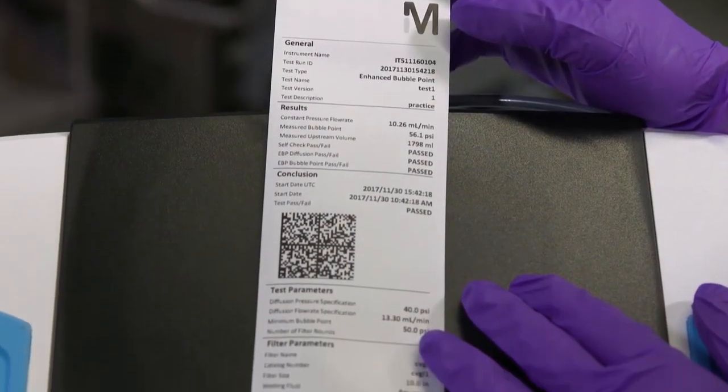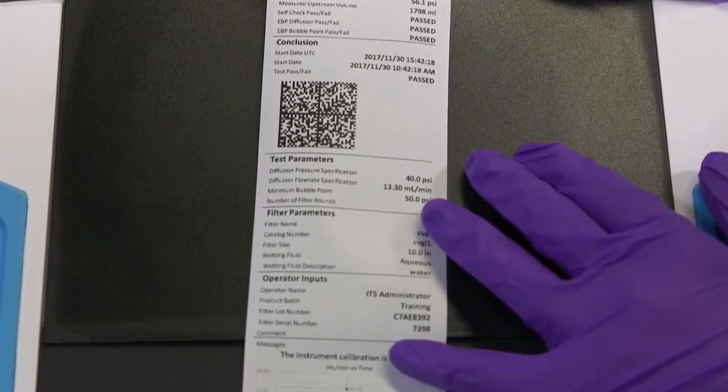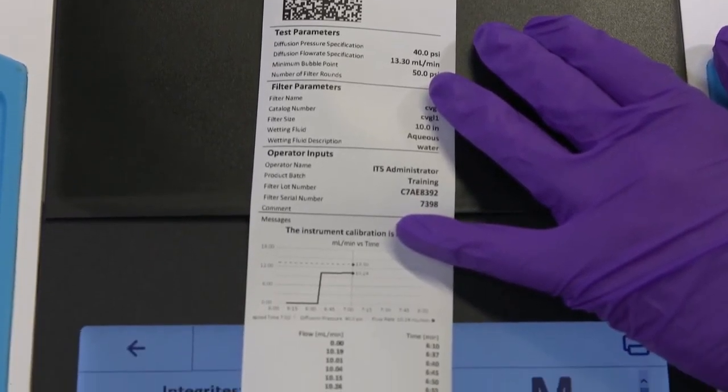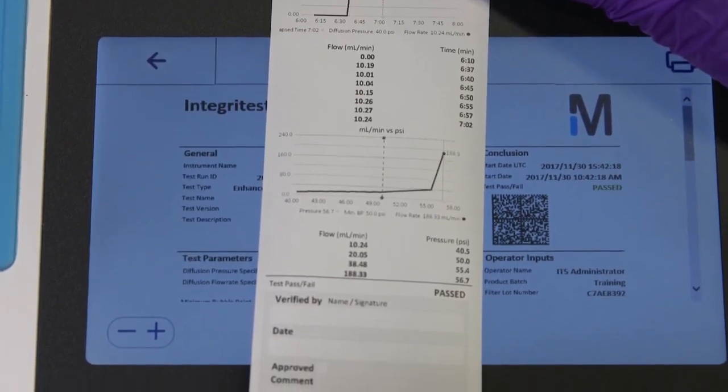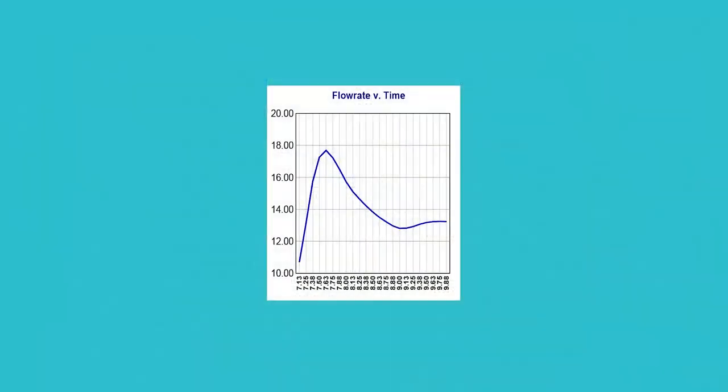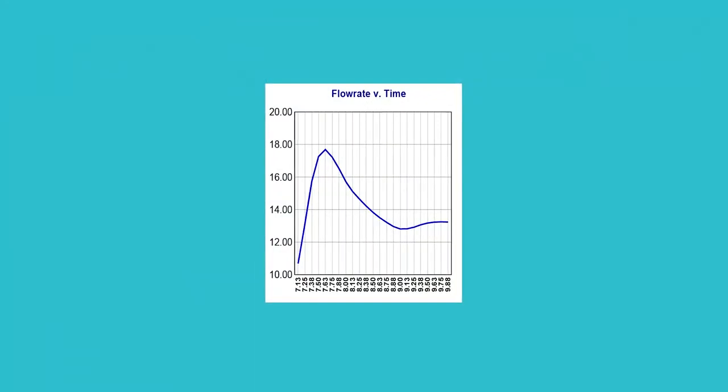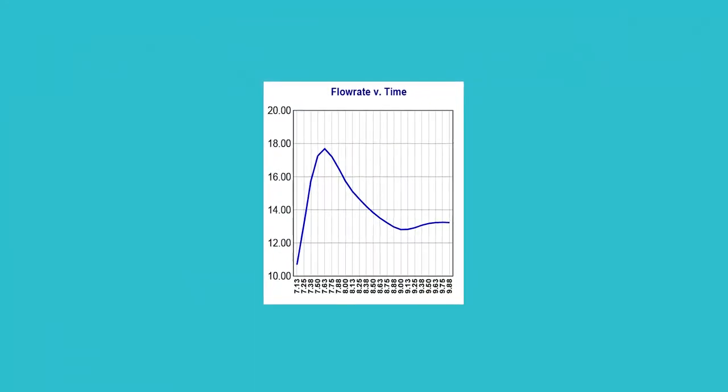When the test is complete, you will want to evaluate the results to ensure the test was performed correctly. If the test failed, reviewing the printout can also provide important clues as to the possible root causes. Here is an example of a printout where there was a false failure due to temperature decrease.